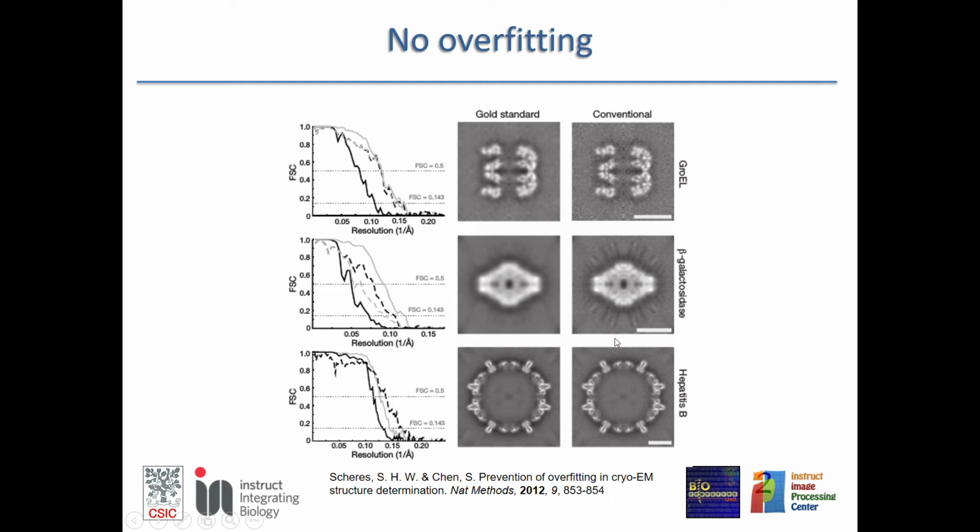So there is a ground truth, and my object is the ground truth plus something else. This something else is the bias. For instance, a very typical sign of overfitting are these stripes around. These stripes outside your structure mean that you typically have some problem with the angular alignment. Some other very common indicator that you have a problem is this negative halo around your structure. That is normally a problem with the CTF. So you have not estimated or corrected the CTF correctly.